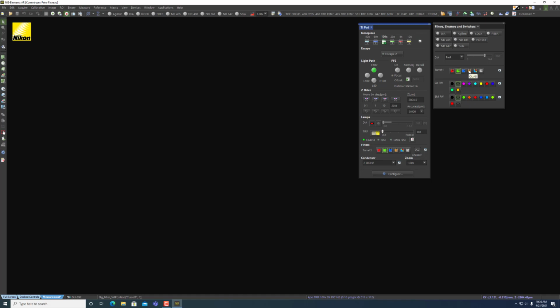So for that, anytime you use the excitation filter wheel or the emission filter wheel, you'll need to use this quad. This right here is our excitation filter wheel. We have one that just blocks all light. We have one that lets in all the light. So this is ideal if you're going to use one of these three colors. You'll want this to be empty. And then all of these are specific excitation filters.